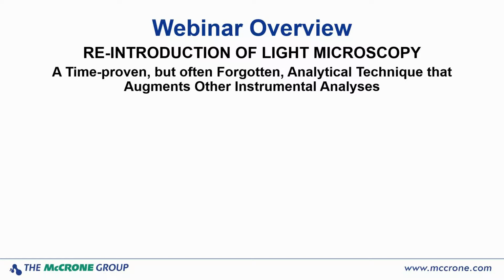Anyhow, again, my name is Bill Chapin, and I have been working with light microscopy for decades, actually, and any of you that know me know that that's my go-to device. I really think that there are a lot of people out there in industry that are not utilizing the light microscope as much as it could be. I think it lends itself to a lot of improved analyses and a lot better sample preps.